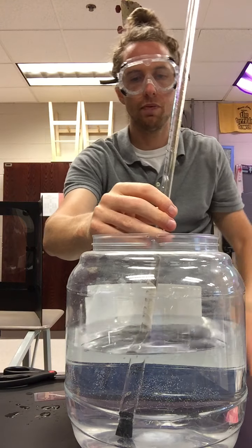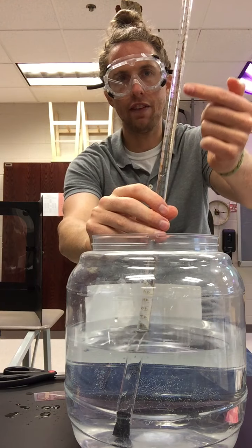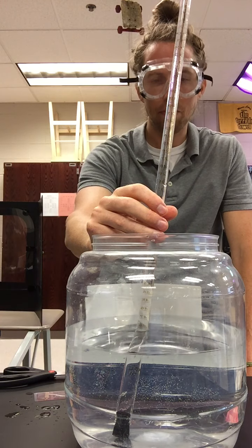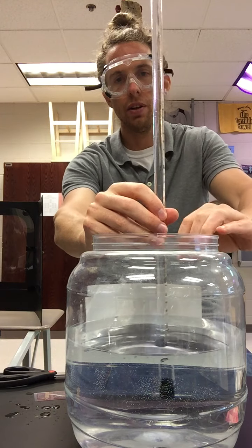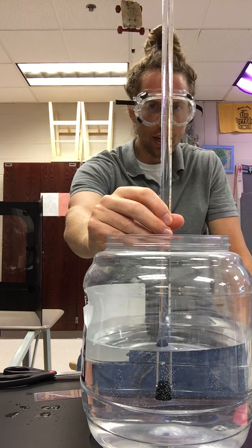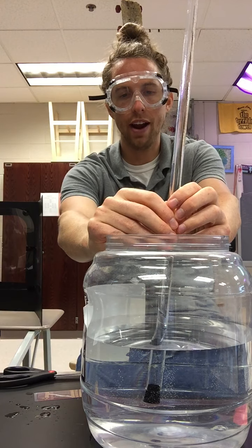be displaced. So what we're going to see here is that the acid is going down. It's hard to see on camera, but you can see kind of some oily stuff going down here. And as the acid goes down in this tube, eventually it's going to meet the magnesium, and we're going to see a reaction. So I'm going to hold this up a little bit higher, let me turn this for you, so that you guys can see that magnesium. And pretty soon the acid is going to interact with the magnesium, and as the acid interacts with the magnesium, again, we'll see that reaction.